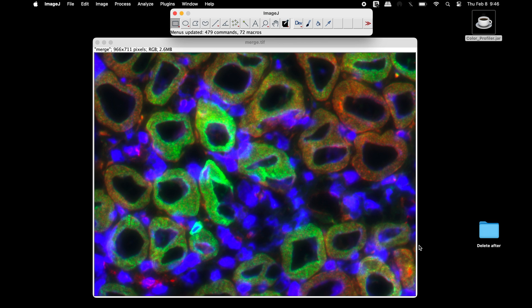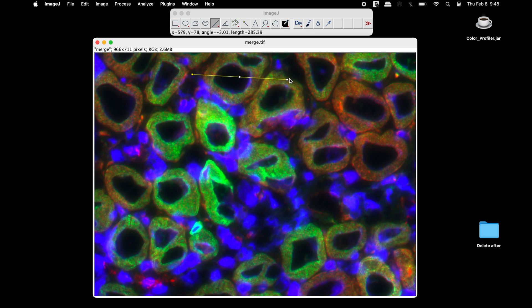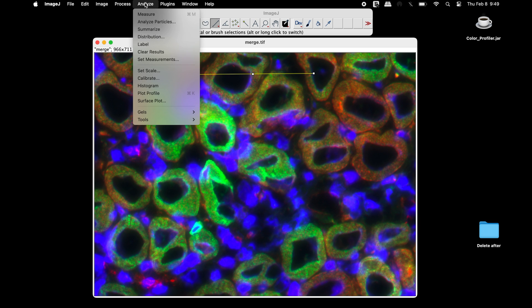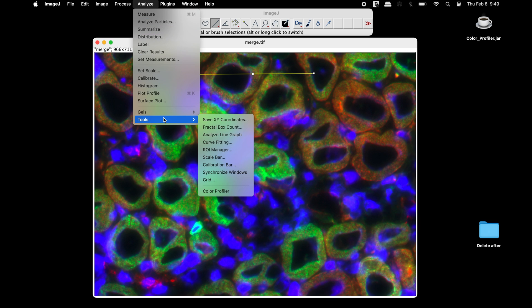Now, select the line tool from above and draw a line in the image to mark the region of interest. Next, click on Analyze, Tools, and select the Color Profiler plugin.